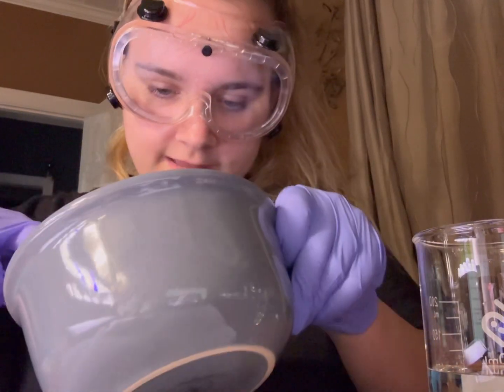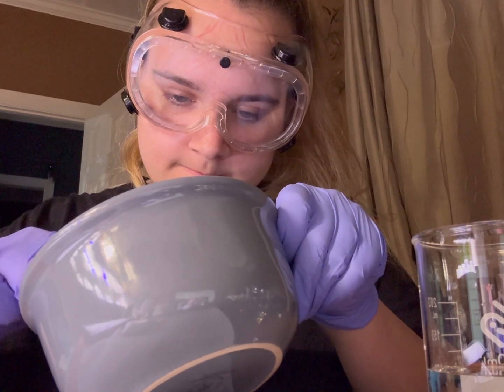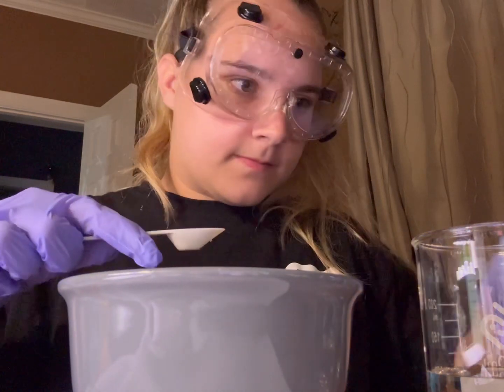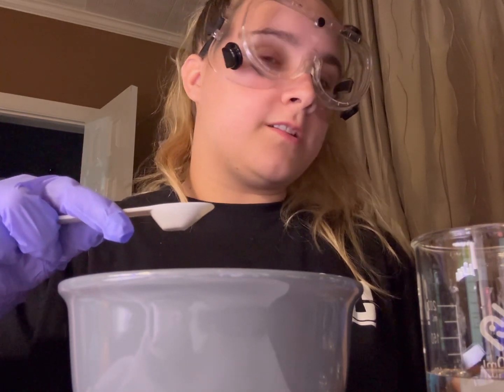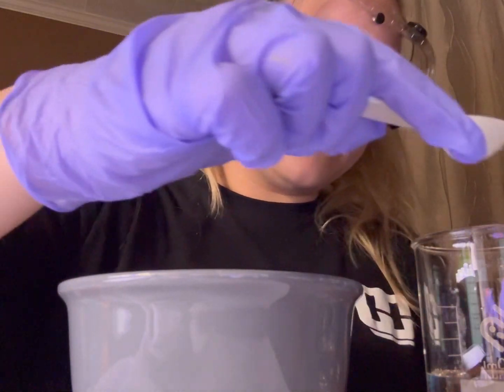So I'll try to get like half of a teaspoon using this. Alright, and then we put sodium chloride into this water and stir it. And then we'll restart the fire again and see the boiling point of this.